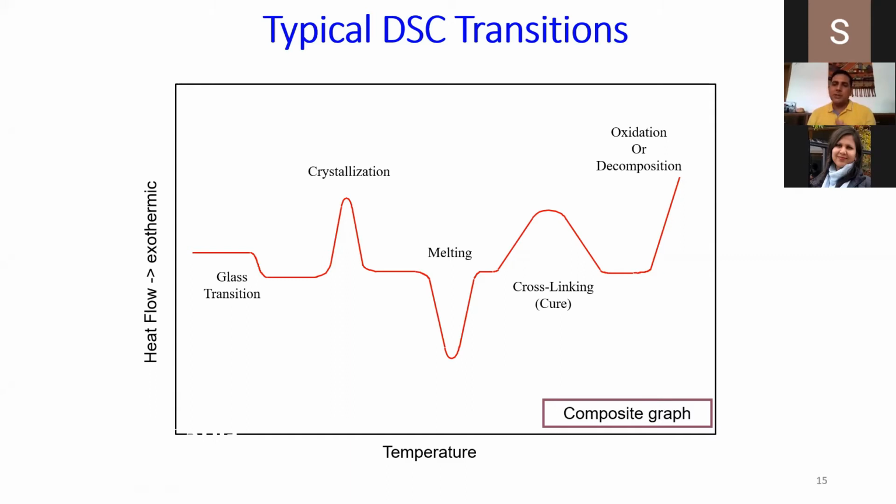If your oxidizing environment is oxygen, but you are putting a nitrogen gas environment there, the sample will not be oxidized, but your temperature is increasing. So in that case, your sample would decompose. It may decompose with some other components. That can happen at high temperature.